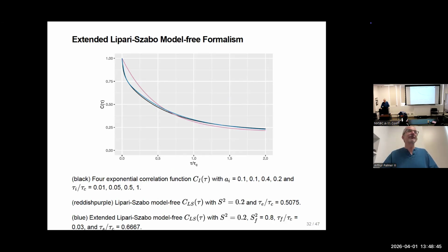So at least 3/4 of the relaxation data on proteins are analyzed with one of these 2 functions or slight variants. There are other approaches, and that's in part because you just run out of data. Particularly this limitation that once you get to high field, the spectral density functions are all decaying as 1 over omega squared, limits the information content available.